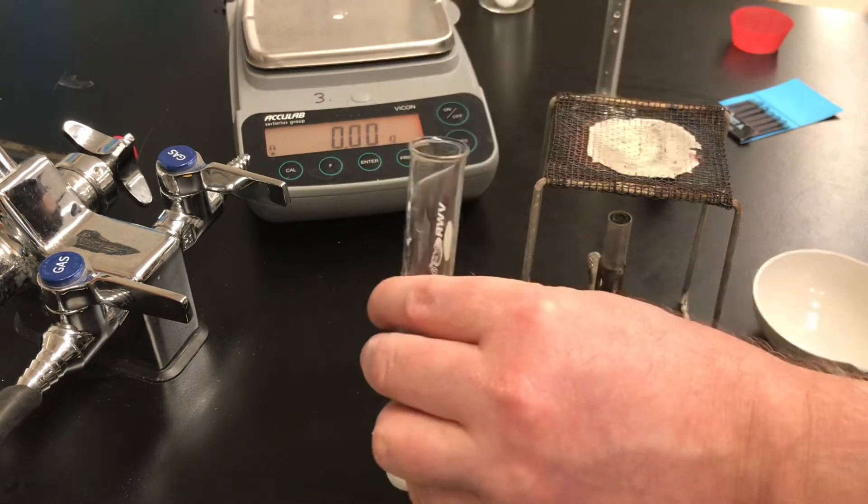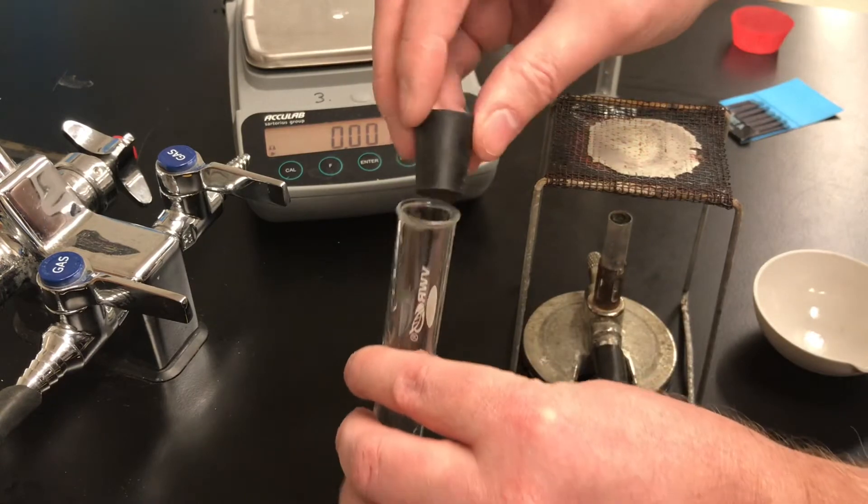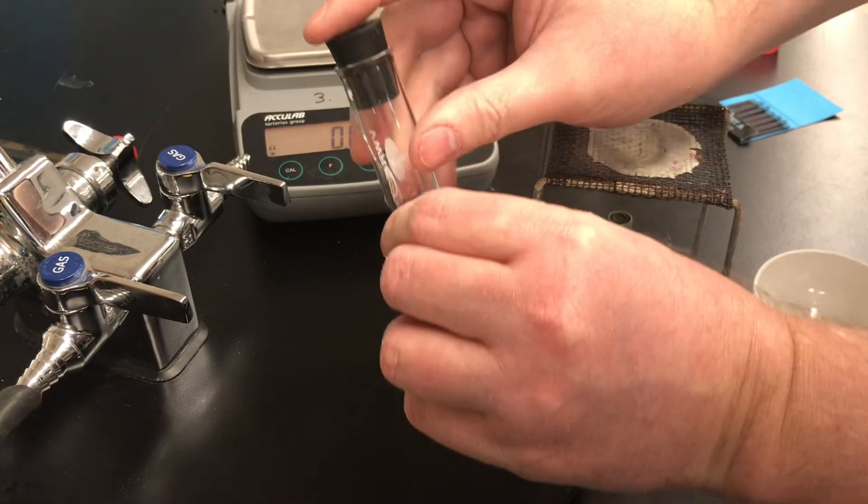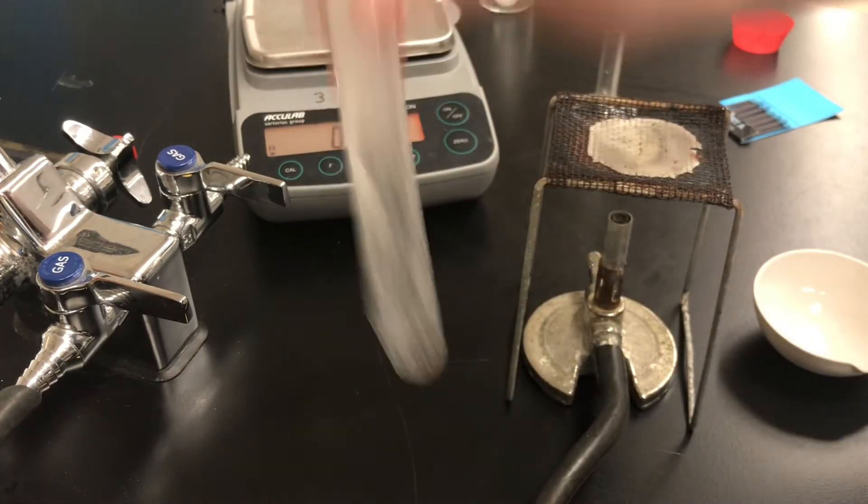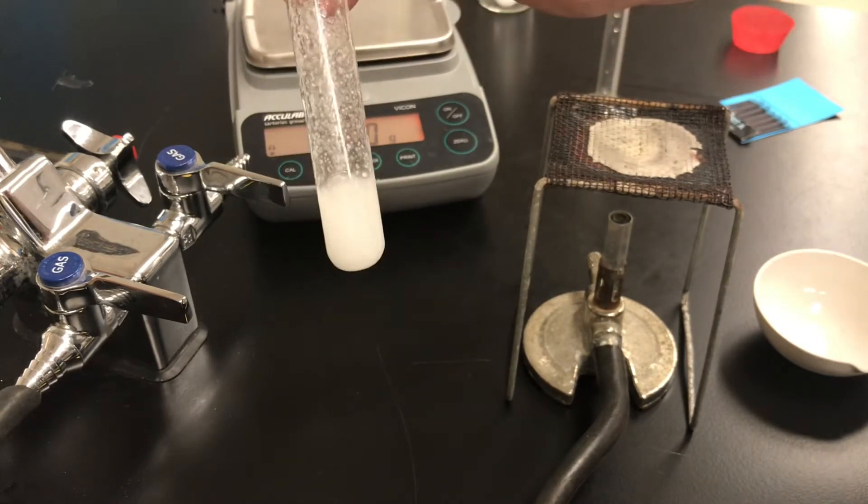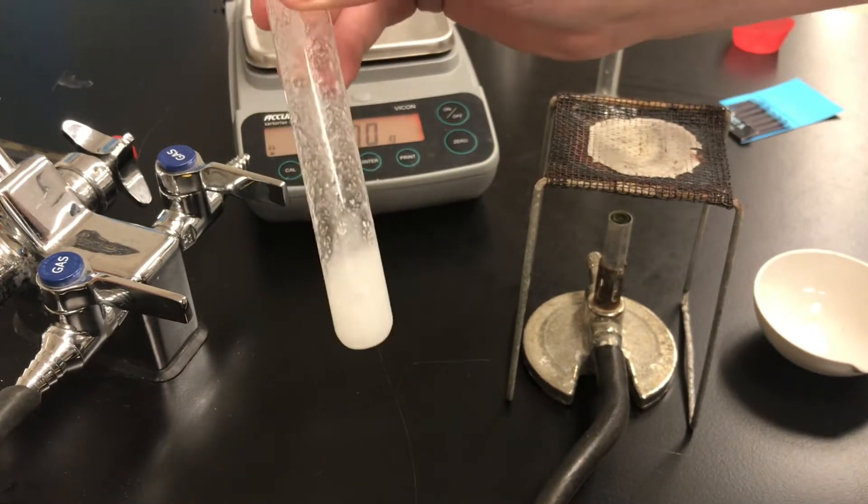We're going to take a rubber stopper and put the rubber stopper on top of the test tube and then we're going to shake for about five minutes to dissolve as much of that salt as we can.